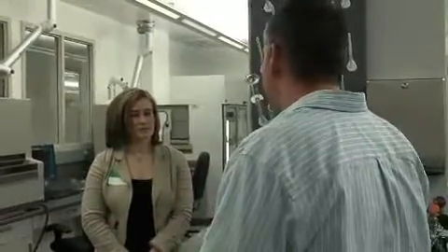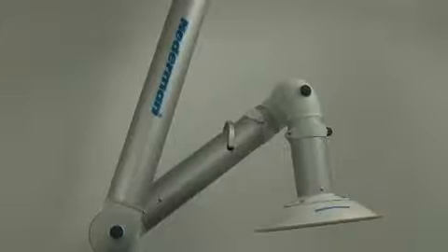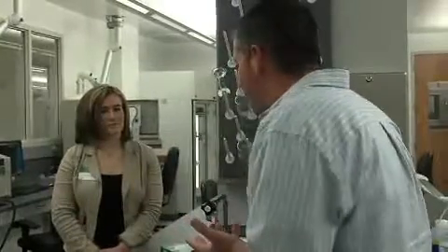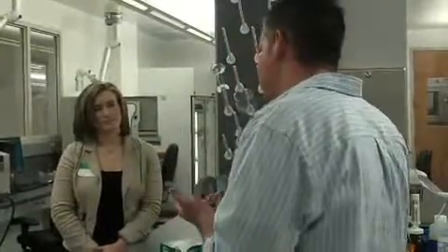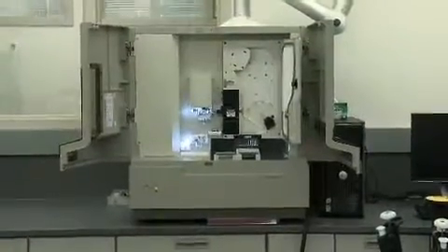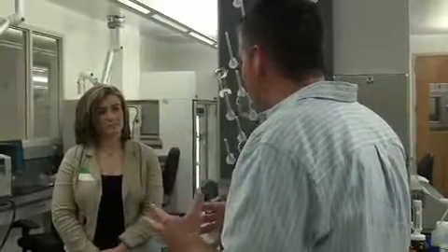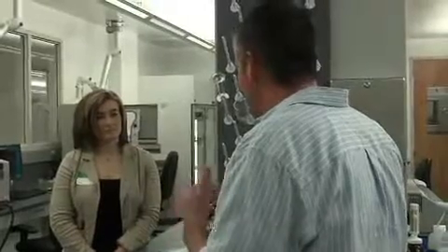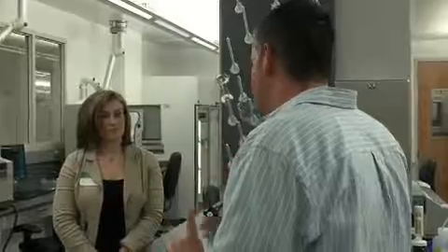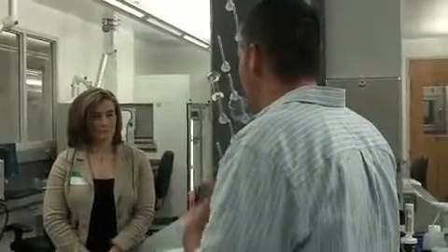Something else that we put into this room are the Niederman hoods that you actually see above the instruments. The advantage of those is that the instruments actually give off a lot of heat because they have a built-in laser inside of them. They also have a camera. Both of those give off an extraordinary amount of heat. In our old laboratory, what happened is all that heat was just filtered into the room. So we had just extreme temperature changes in that room from when an instrument would kick on to when it would kick off.